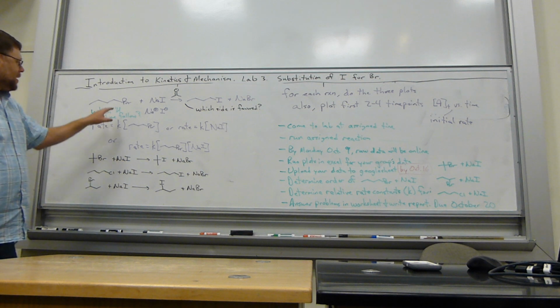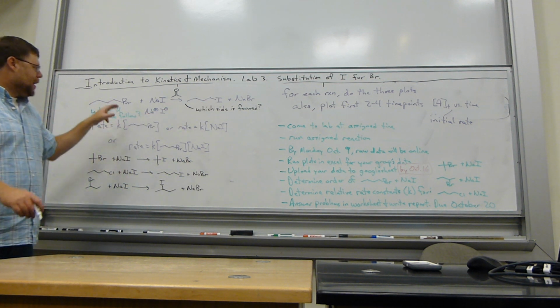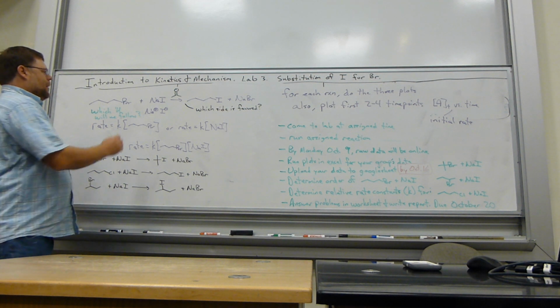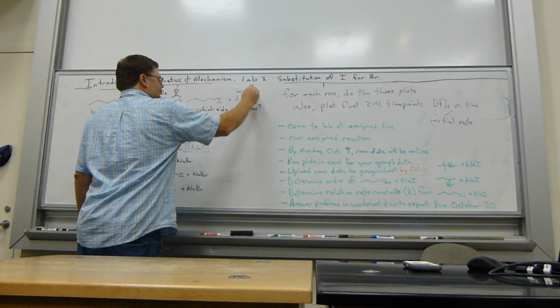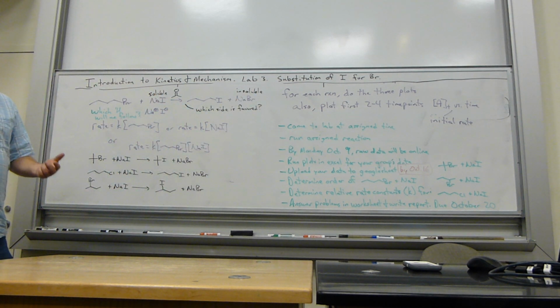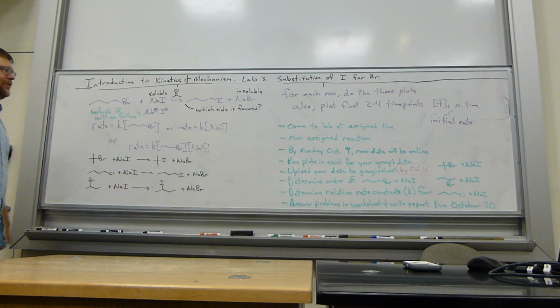I'll just cut to the chase. The carbon bromide bond is stronger than a carbon iodide bond. Thermodynamically, the left side of this reaction is more stable. However, sodium iodide is soluble, and sodium bromide is insoluble in acetone. So keep that in mind. Just make observations. You're going to run this reaction, and you're actually not going to have to work very hard in this experiment to do the experiment. So which side is favored? Which protons are we going to look at?